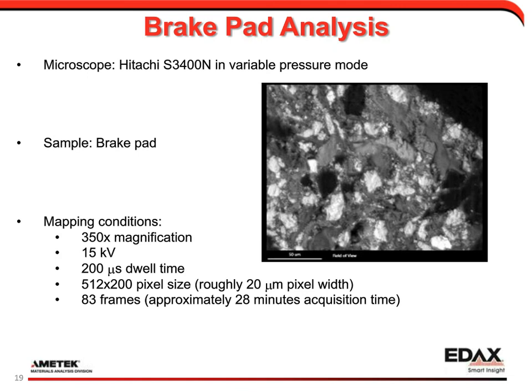There's a question about the accuracy of the EDS measurements. Again, that highly depends on your sample. I mentioned when we do our quant numbers, we have a few assumptions we make about the sample. Number one is that it's perfectly flat. Number two is that it's completely homogeneous within the interaction volume. And number three is that it's infinitely thick as seen from the electron beam.